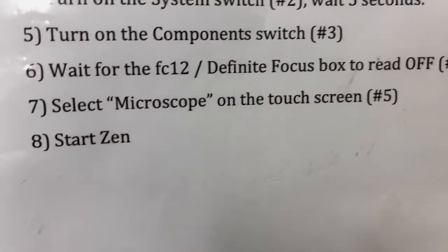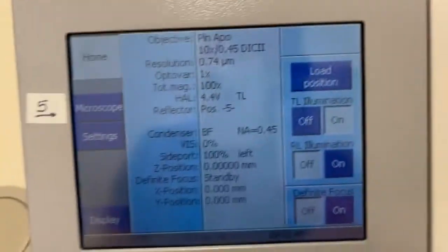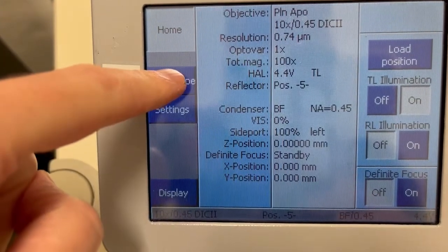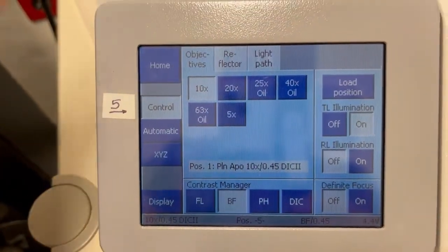The next step, step number seven, is to select microscope on the touch screen. You can see the button that says microscope. We're going to press that, and that will give us access to the most commonly used functions on this touch screen.